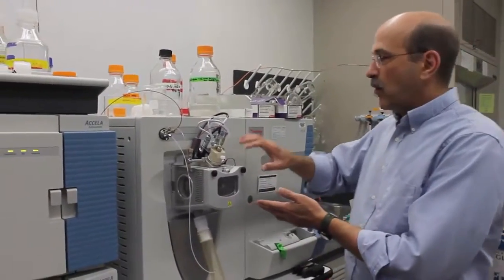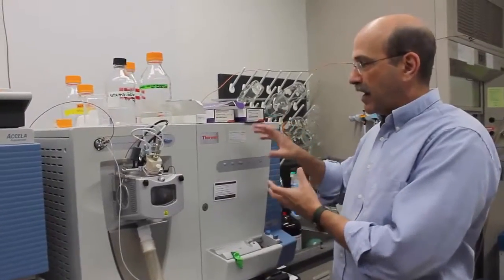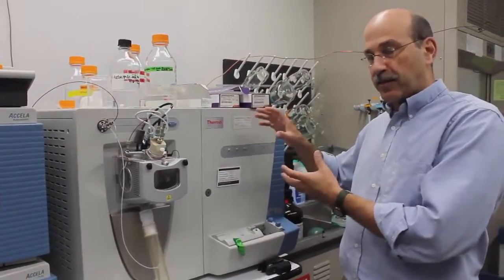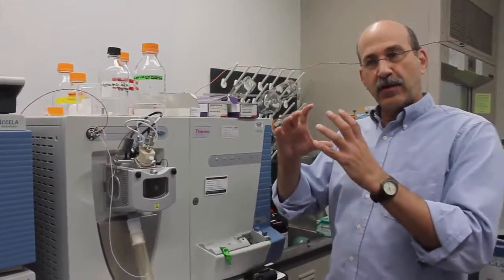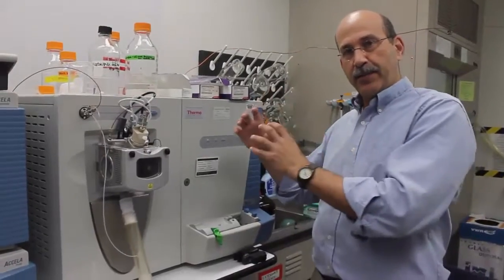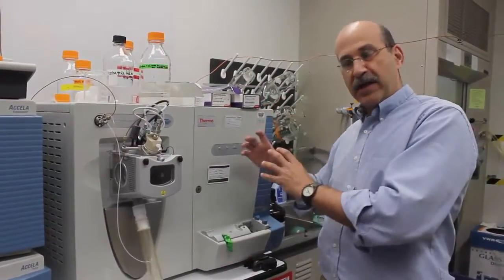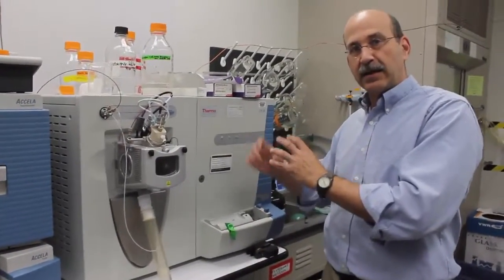After it's charged, we can separate based on the mass to charge ratio using an ion trap, again allowing us to do MS, MS, MS as many times as we want for an analyte, taking the original molecule, breaking it up, selecting a fragment, breaking that up, doing it as many times as we need to get the selectivity we need to make sure it's only for that analyte.